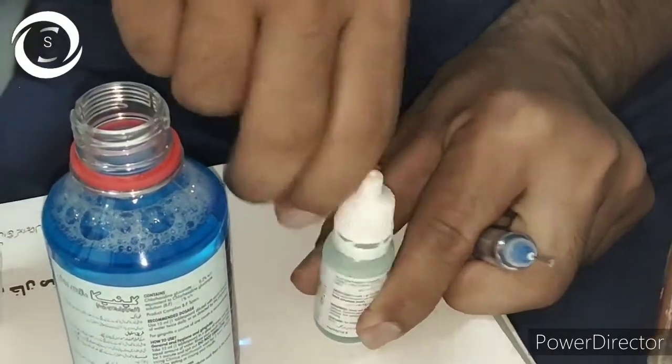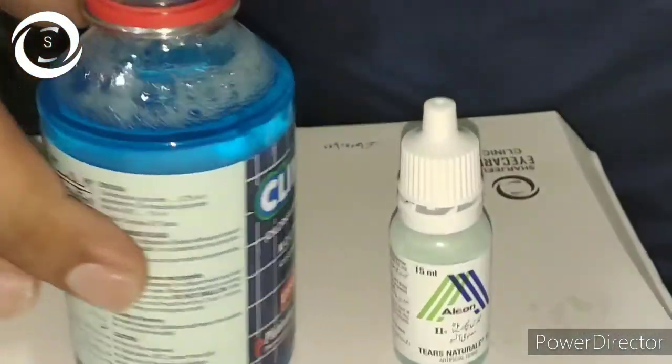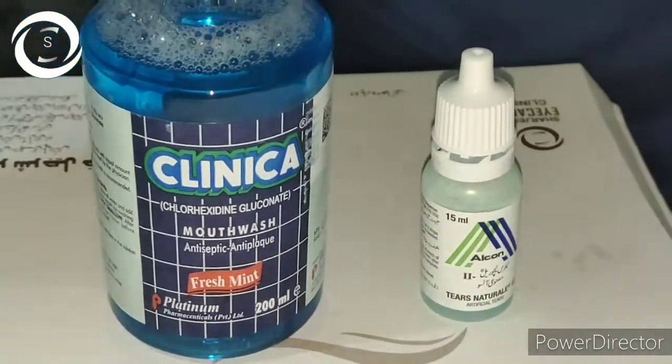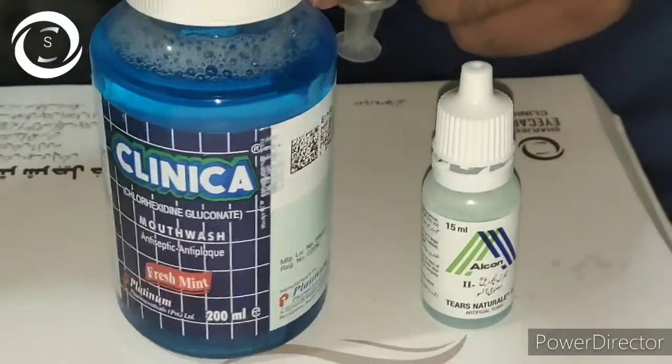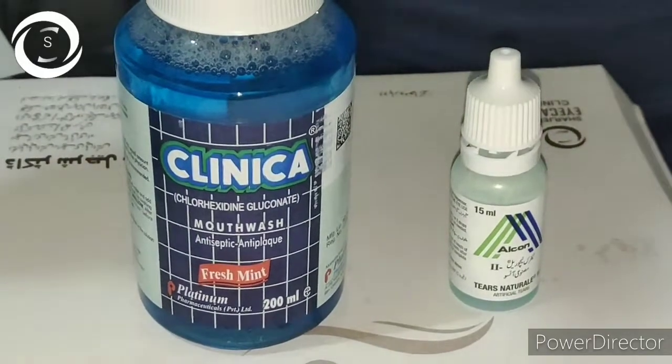That's how you prepare 0.02% chlorhexidine drops in acanthamoeba keratitis. I hope after watching this video you will be able to prepare it easily. Thank you very much.